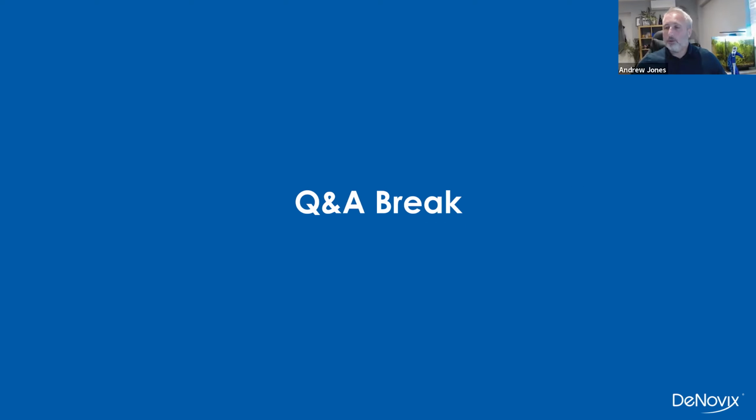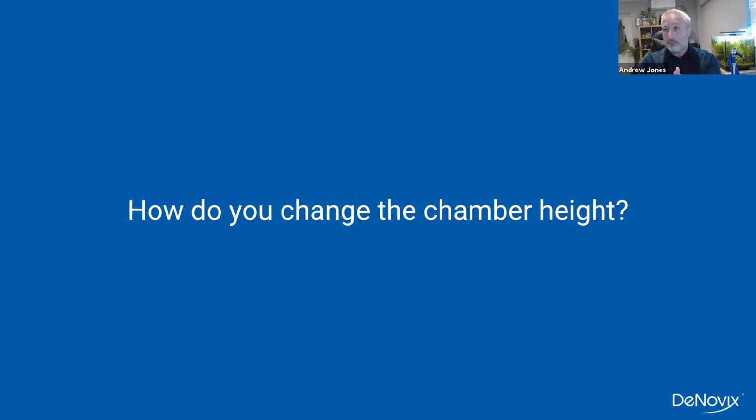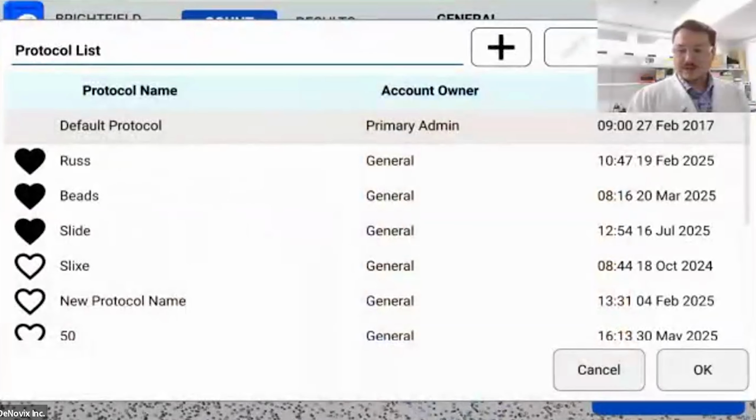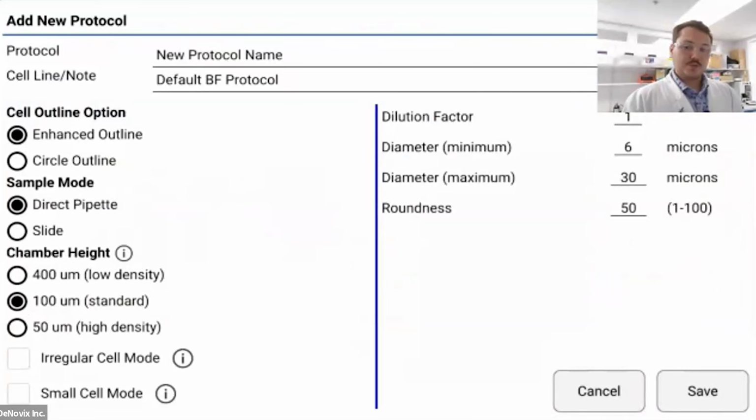Cool. There was a question from a current user about how you change the chamber height. And if you could explain that. I don't know if we can switch back to the instrument or not, whether we have that set up. Yeah, so we could definitely show this screen again. It would be in the protocols section of the app. So I'm just going to pick the Brightfield app. And then once I get onto protocols, if everybody can see my screen, I'm going to hit this plus button here to create a new protocol.